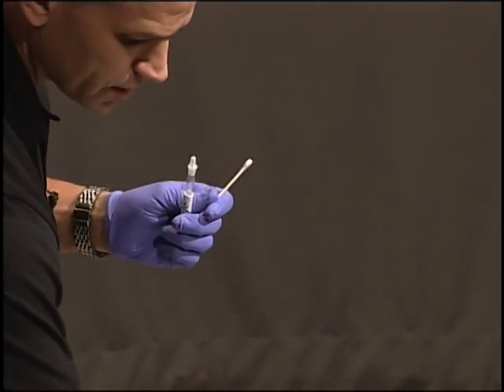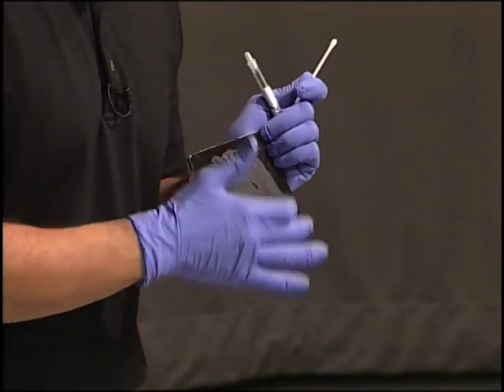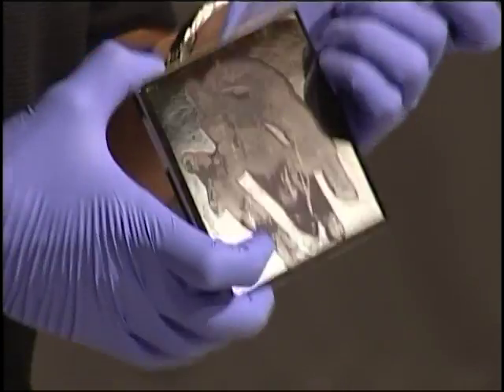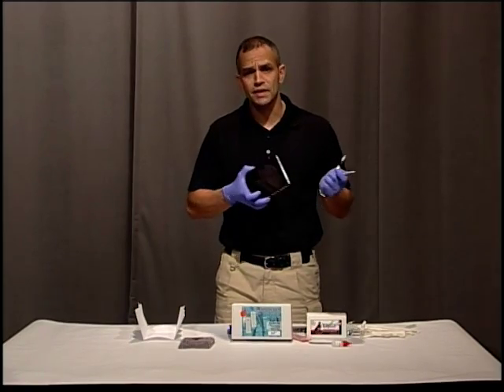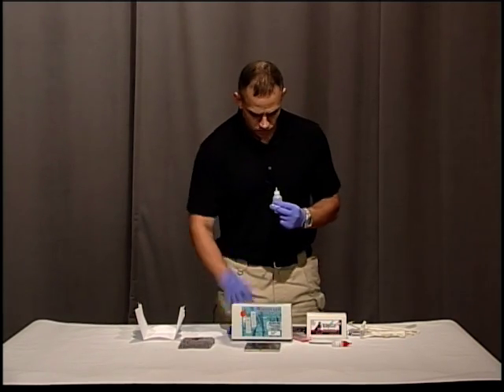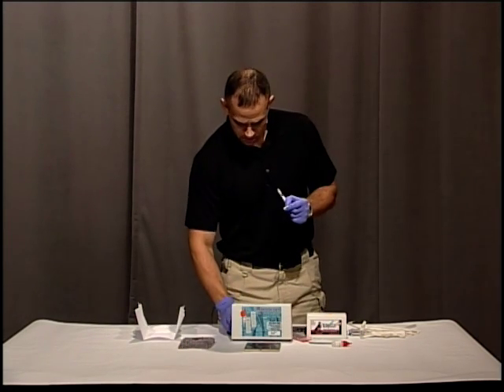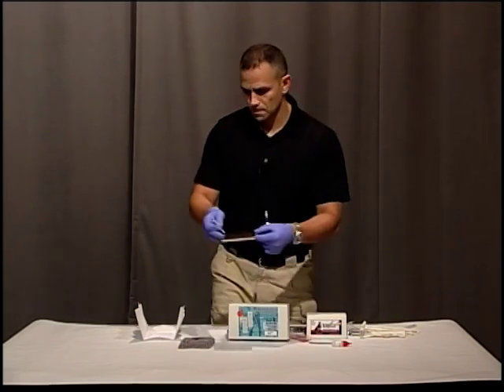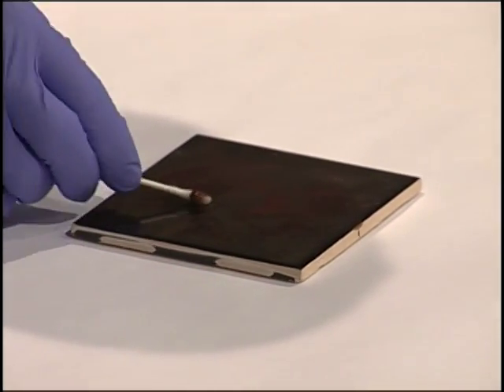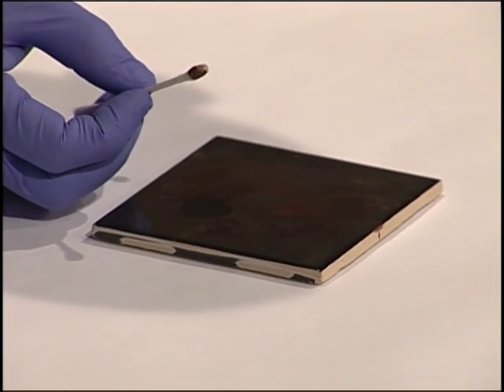I'm going to be testing some dried blood. It may be difficult to see because it's on a black tile, but there's some dried blood on here. If you didn't know that it was blood, you may misinterpret it as something else. The first thing I'm going to do is take some distilled water and just wet the tip, then swab my stain. You can see that I have quite a bit of material on there.